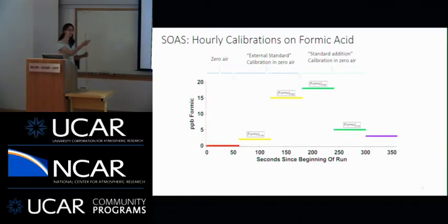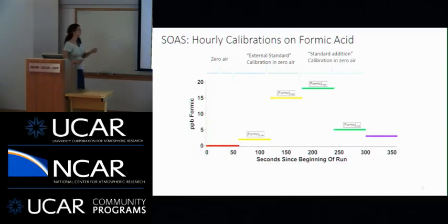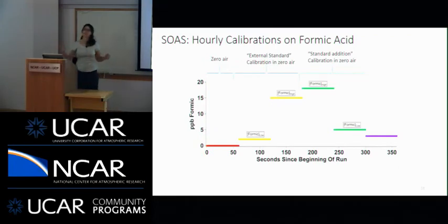We then turned off the zero air, and we pulled in atmospheric air. And what we then did was effectively a standard addition. We would add in formic acid on top of what exists in the atmosphere at the time. Of course, in that case, if there's some formic acid, in this case you can see about 3 parts per billion in the cartoon, we would add our 2 parts per billion and we would see slightly elevated amounts. So this gave us two separate measurements of how sensitive our instrument was to formic acid.